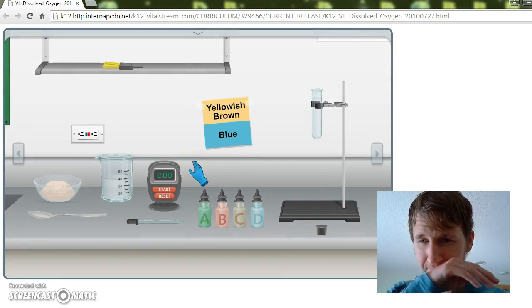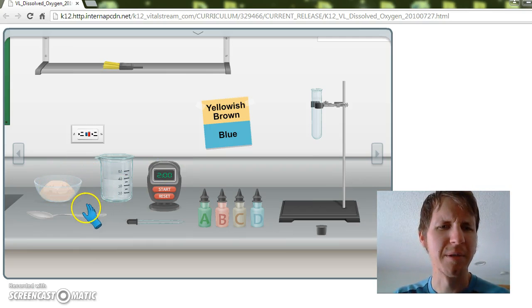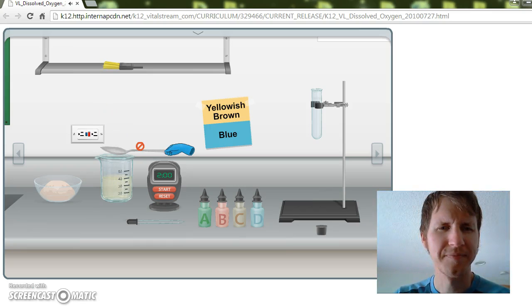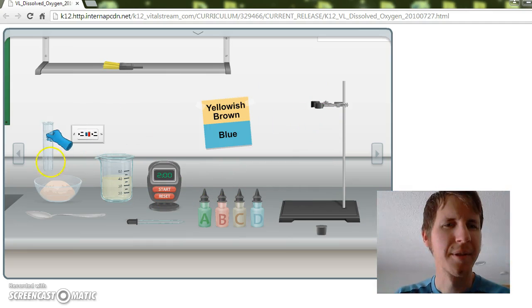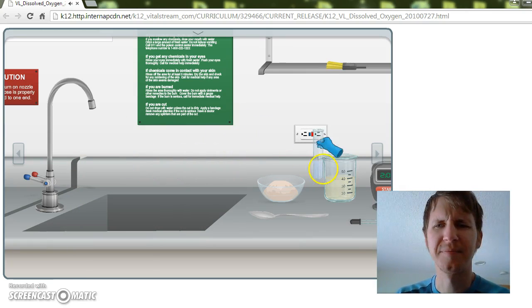So what we're going to do, as you can see, we have a workstation here, and we have a nice timer. We have our yeast, which is going to act as our microorganism. We have water that we're going to mix the yeast in. And we're going to run 3 trials. We're going to use a little bit of chemistry here. I'll be pausing midway through because sometimes there's a 2-minute wait for each one, and we'll want to make sure that is good.